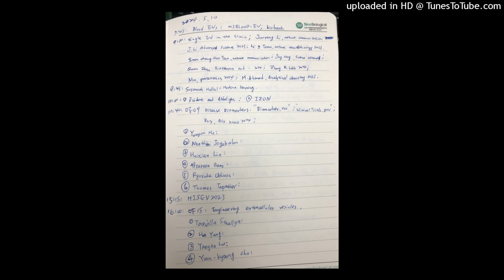Okay, when we're doing proteomic analysis, I think before we even compare a patient to a healthy cohort, we need to understand the dynamics of pre-analytical variables before we go downstream. So our initiative was to look at postprandial versus fasting, which time of day you take your sample, and especially for urine samples, whether it is a random urine or a 24-hour sample, because this impacts the data that you're going to compare.